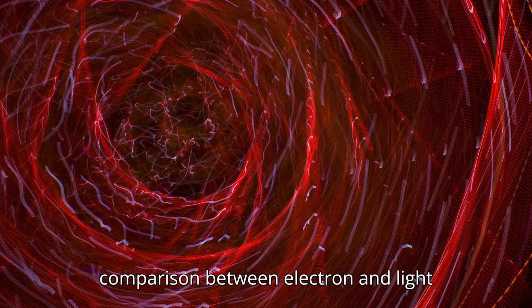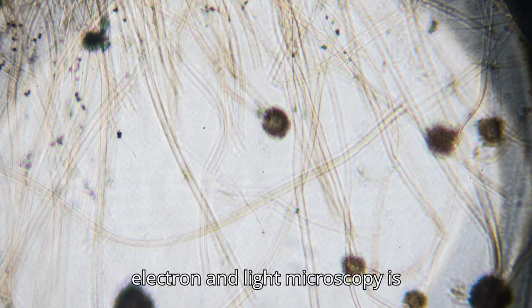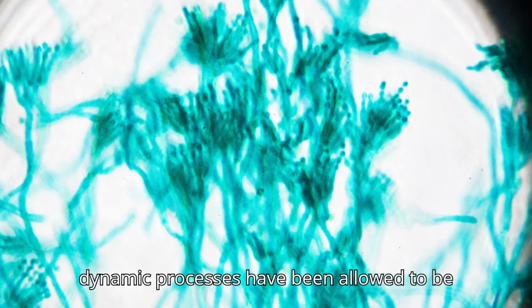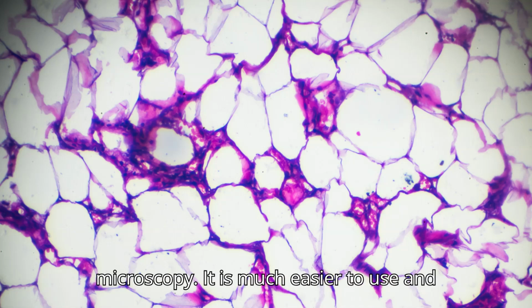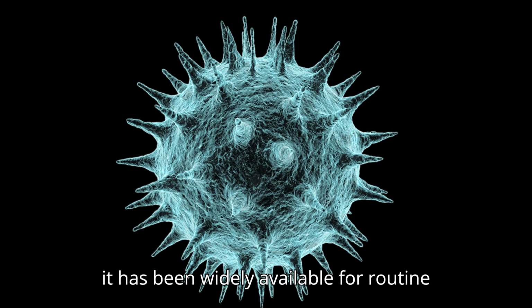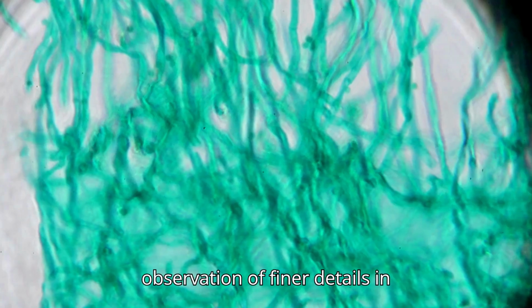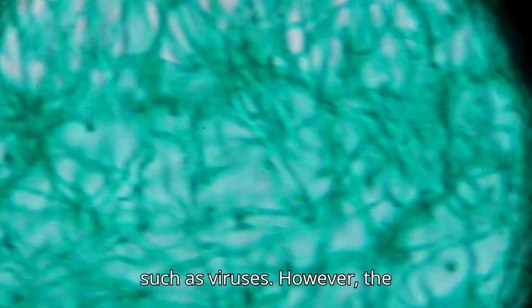A comparison between electron and light microscopy. The choice between electron and light microscopy is determined by the kind of specimen and scale of observation. Live cells and dynamic processes can be examined with the aid of light microscopy. It is much easier to use and much less costly, so it has been widely available for routine clinical diagnosis and research. However, its resolution makes observation of finer details in subcellular architecture or tiny objects such as viruses challenging.